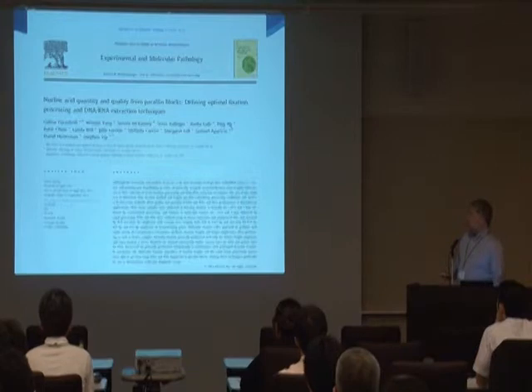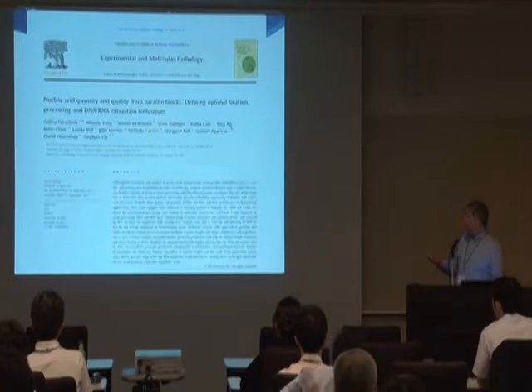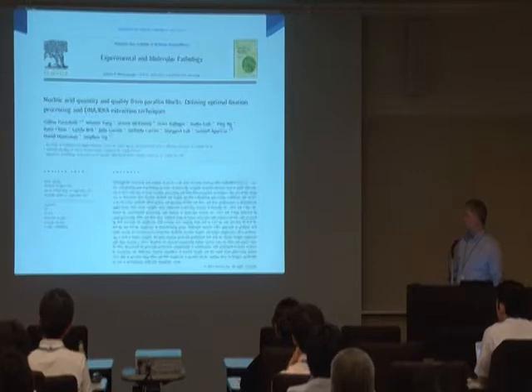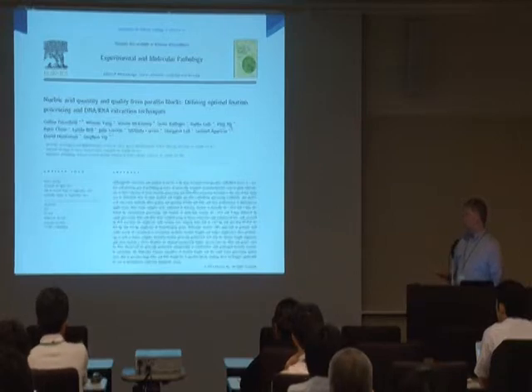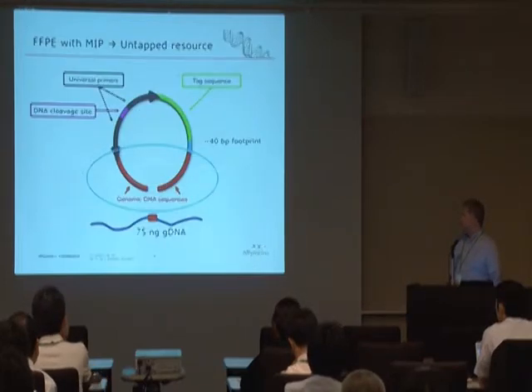And so some of my colleagues at the Cancer Agency did some more work on this. This is actually a nice paper for your reference if you're at all interested, looking at quantity and quality of nucleic acids from paraffin blocks, looking at optimal fixation times and DNA extraction techniques. They looked at fixation in buffered formalin, and also extraction using a molecular fixative, which is basically 90% methanol. So if anybody's interested, this is a really nice paper if you're planning on doing any work looking at these kinds of paraffin-embedded specimens.